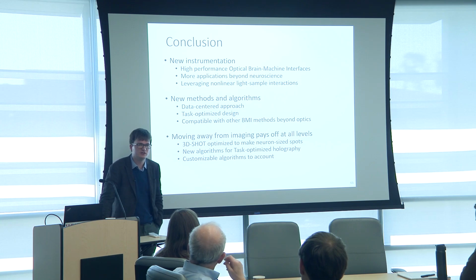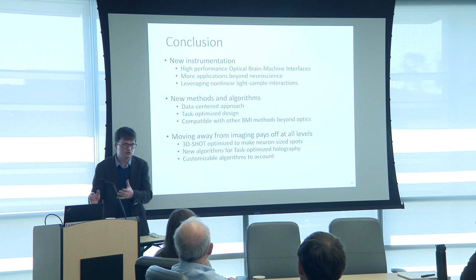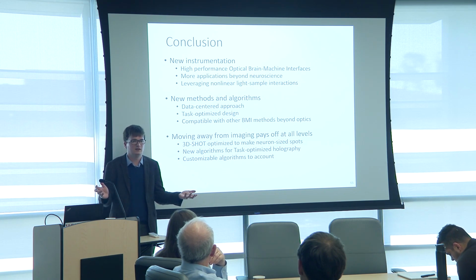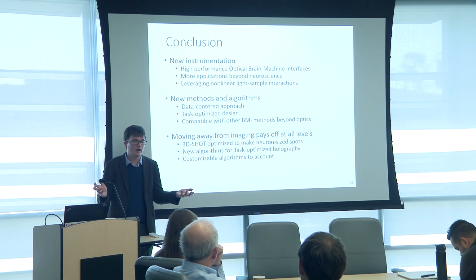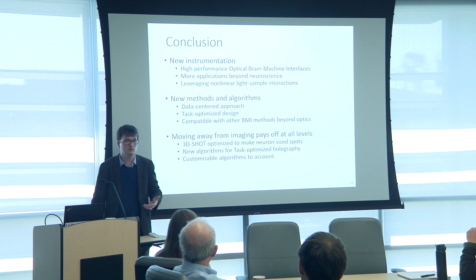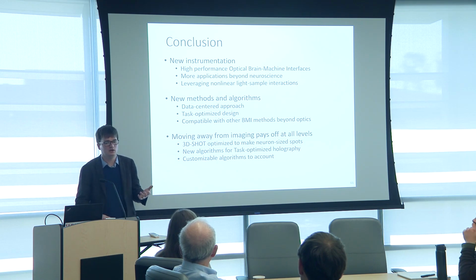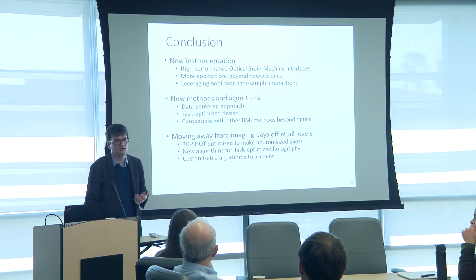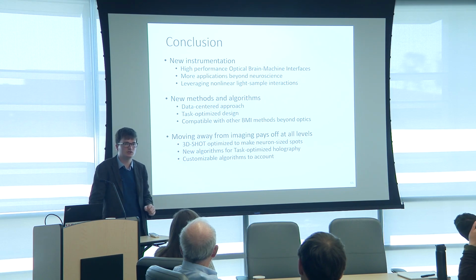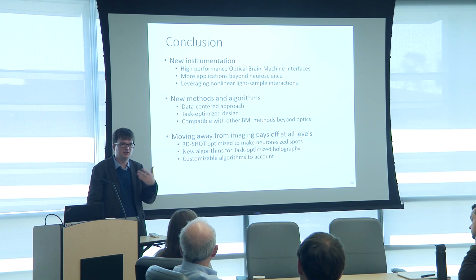The total power efficiency is also relevant. Like from the laser source that you have to the objective, you typically lose a factor 10. That's pretty significant. Right now, the laser cutting industry is driving the laser technology, so we have all the power we want. You're really limited by the brain tissue at this point. So if we had to think about improvements for the neuroscience work in optogenetics, better SLMs is where the money is, because everything else has already been somehow covered.